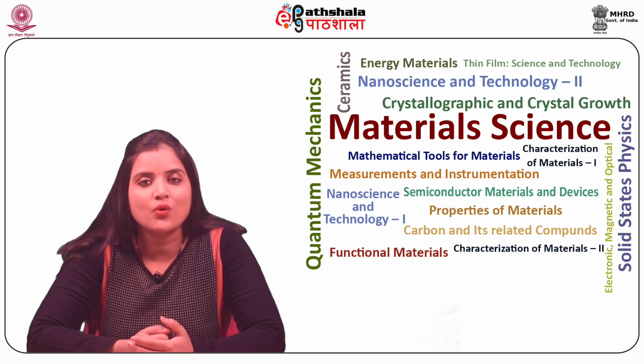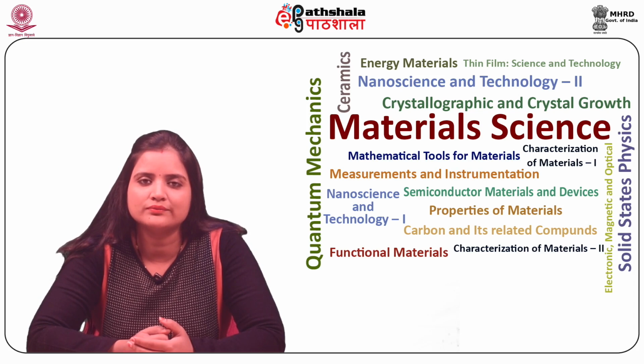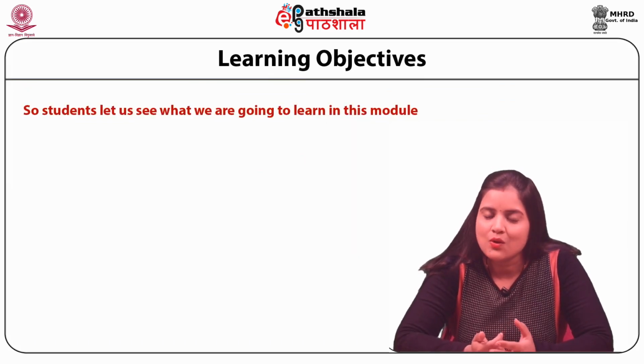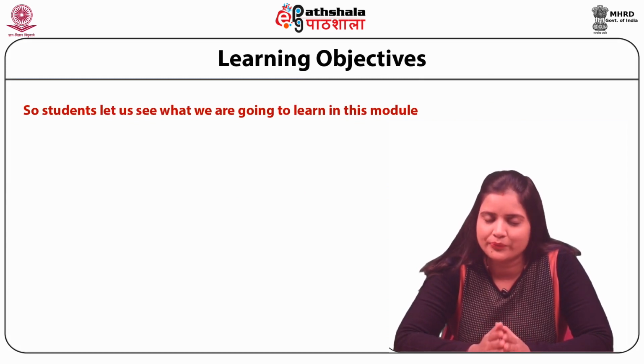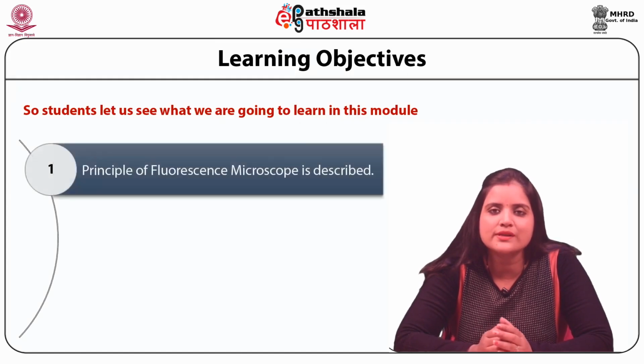Today we are going to discuss the module Fluorescence Microscopy from the paper Characterization of Materials 1. So students, let us see what we are going to learn in this module. In this module, the principle of the fluorescence microscope is described.